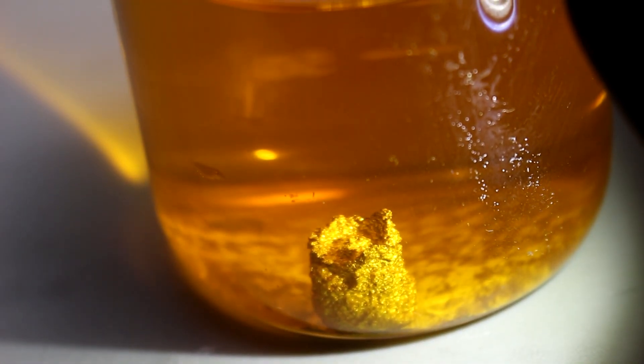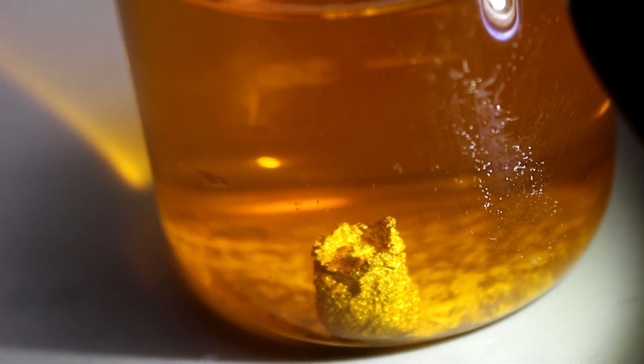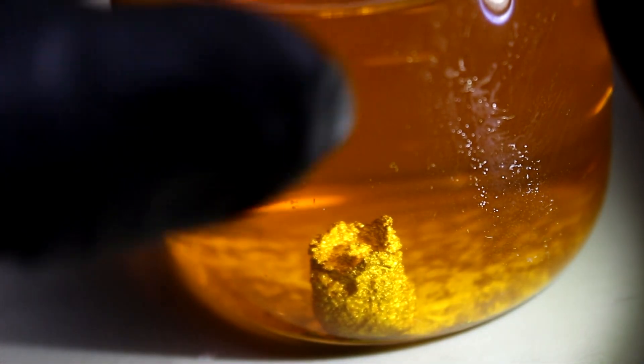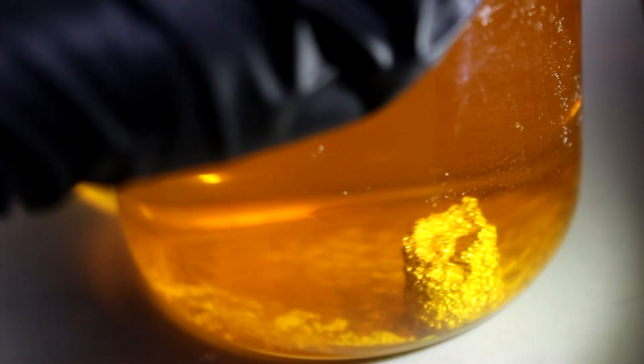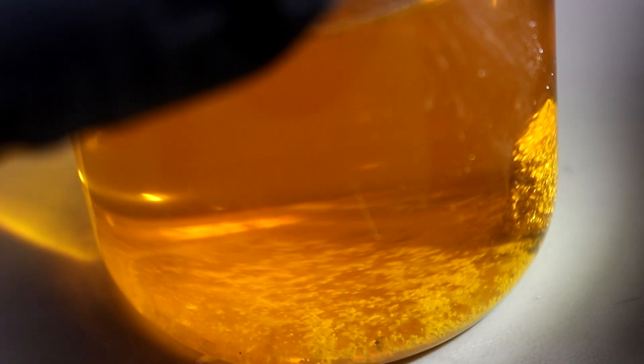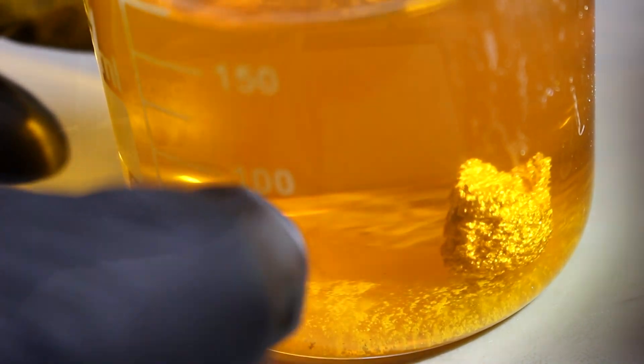So here's our 24 karat gold. As you can see the bullet is still mostly there — I guess nobody should be surprised by that. It's so thick it would take forever to dissolve. You can see that there's some either silver or lead sitting on the bottom of the beaker, so there was some contamination there. So let's pour off this liquid and recover the gold from it.